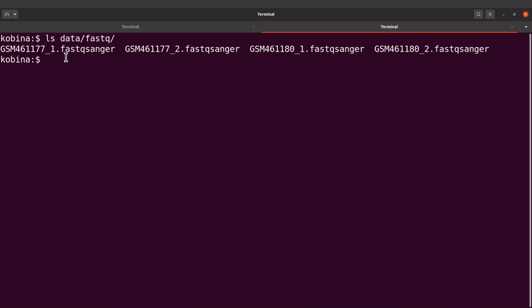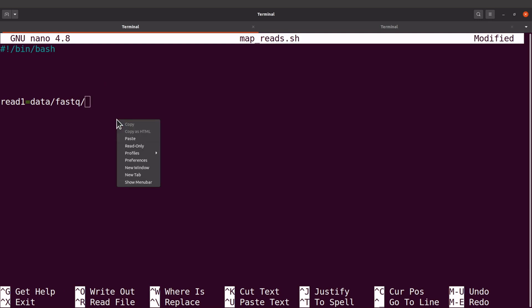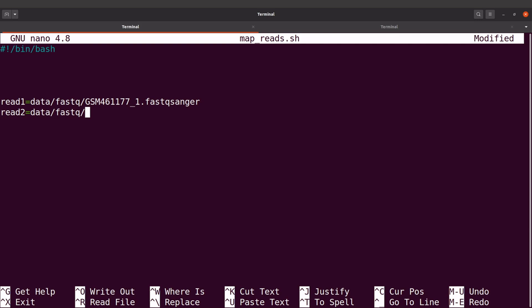I'll pick the first sample and copy its base name. I'll say data/fastq/ and place in the sample ID, then underscore_1.fastq — that's read1. Read2 becomes data/fastq/ with the same ID and then underscore_2.fastq.